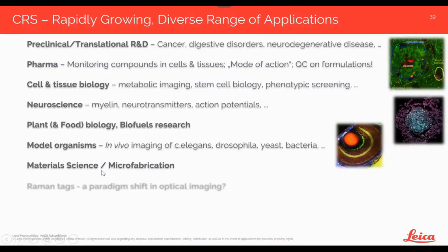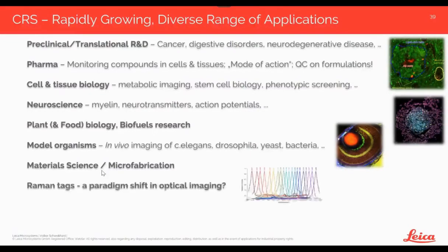An area that is just coming up is material science and microfabrication. Here, the opaqueness of some of the samples has to be considered, but there are in many cases ways to prepare samples that are amenable to, for example, stimulated Raman scattering imaging. And last but not least, we think that the up-and-coming technology of using Raman tags to visualize specific compounds in a vibrational manner can really produce a paradigm shift in optical imaging.